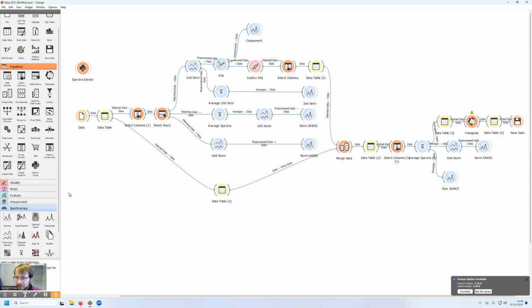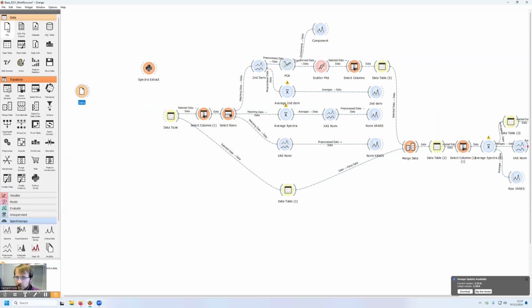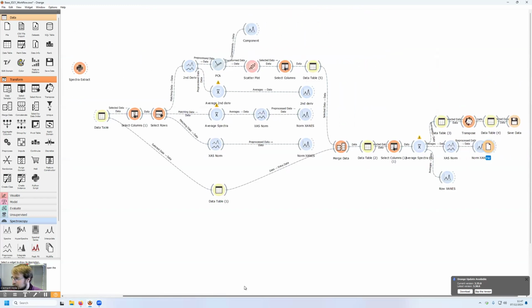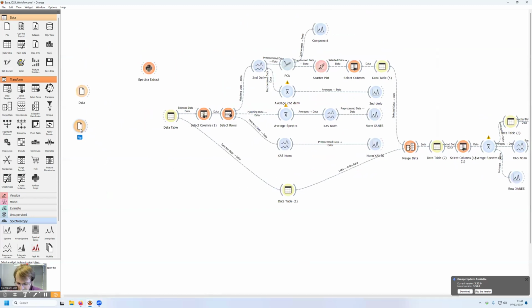Finally, in some cases, you want to use this typical workflow to implement statistical analysis, but you want to compare your data with some references. To do this, you will have to change the opening a little bit. Instead of having just a file, you can break this link here, and you will have your data. You will have another file that has been created here that will be your references.